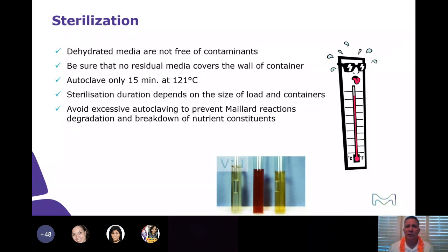And then you got to make sure you check your load size. For certain, if you're sterilizing 15 liters of media, it's going to be a different load than 1 liter of media, and you want to make sure that that center of the autoclave is hot enough. There's other parts of the autoclave where you might end up seeing that there's cold spots, and you should have mapped your autoclave. You should know that ahead of time as well.